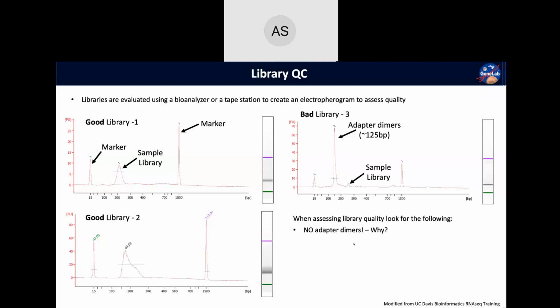I mean, if you have low levels, can't you just remove it with code? Like, you know the sequence, so can't you just say remove this sequence wherever it appears? You absolutely can do that.